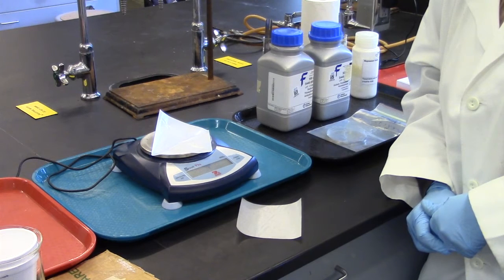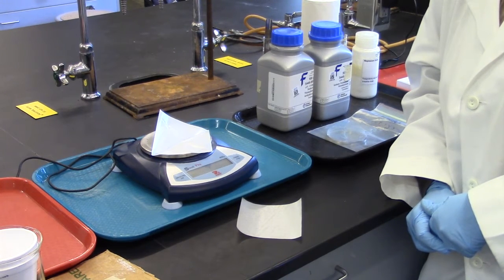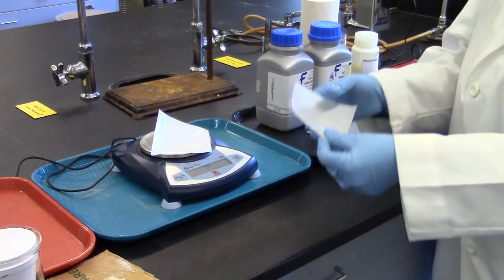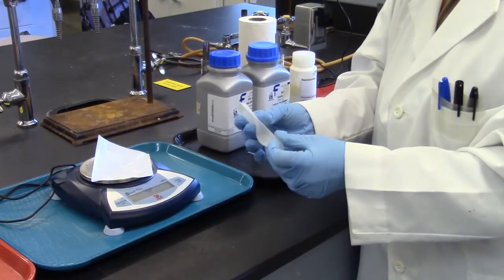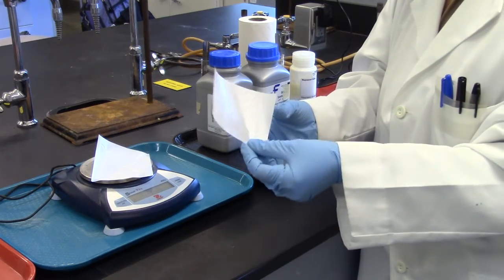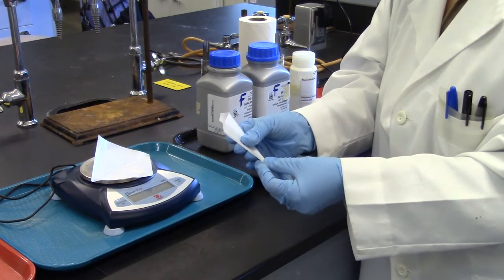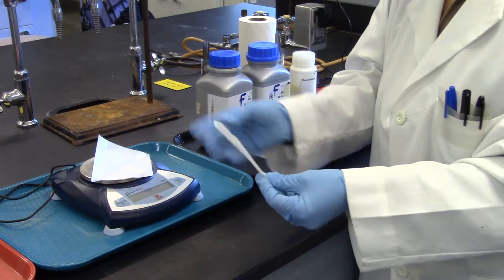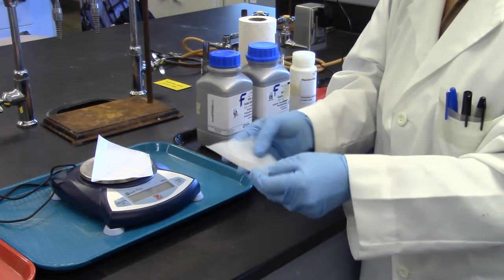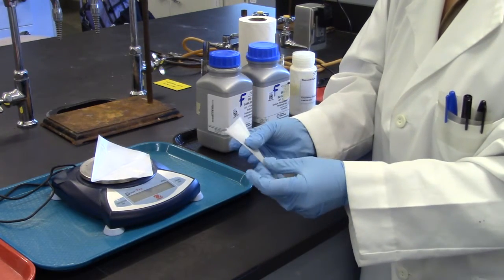Now we are going to do Part B, the enthalpy of solutions. The first thing you will need to do is weigh out two samples, which begins by preparing the weighing paper so that the transfer of the solid to the calorimeter is easier.